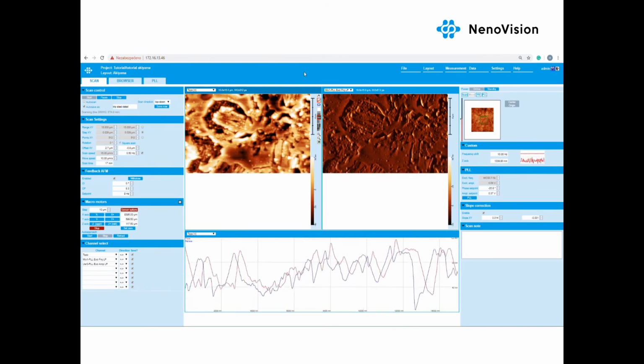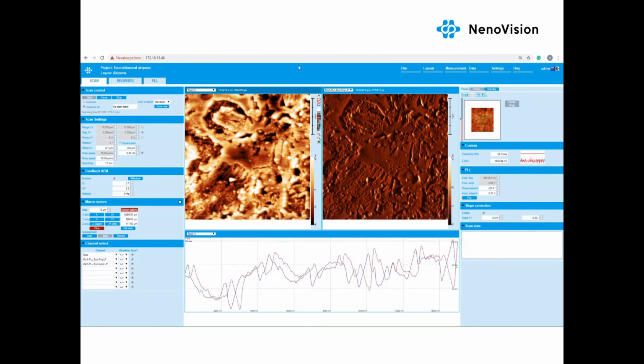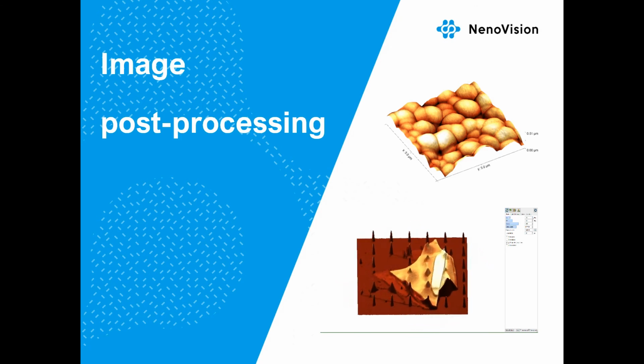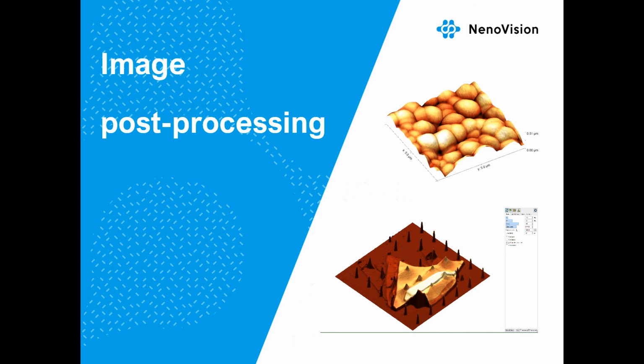After observation of this detail, we are going to finish the measurement, so we don't forget to retract the tip. The last section is dedicated to post-processing of the obtained data. We can either download the file or whole folder of measured images.